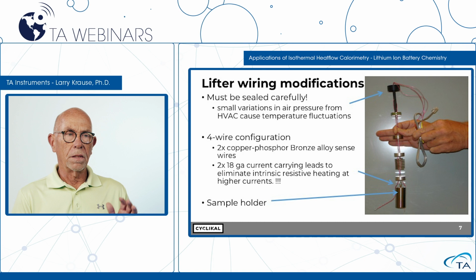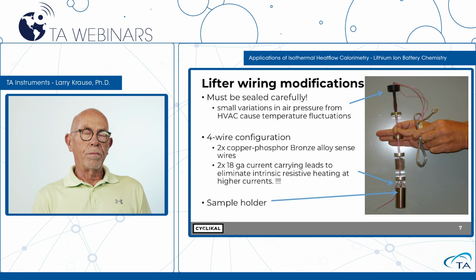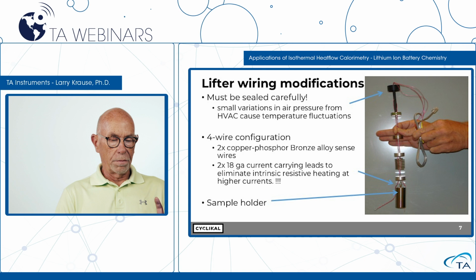Important part about this procedure was sealing the holes that you put in the shunts. So when we first did this, we really didn't adequately seal the holes we put in this main thermal shunt at the top. And for some time, we thought we had them sealed, but for some time, we had destroyed the initial baseline that the instrument came with. So the instrument had a very precise baseline, but once we did our thing with it, the baseline was much, much worse.